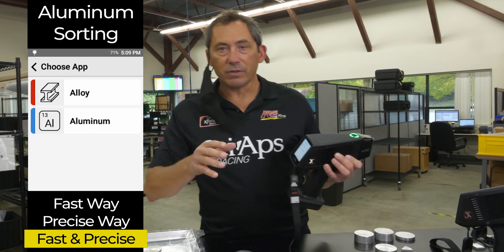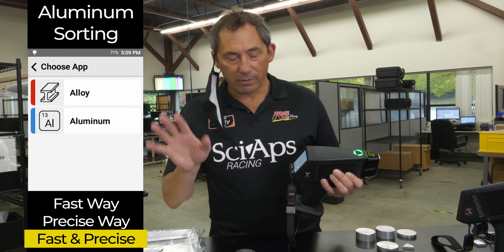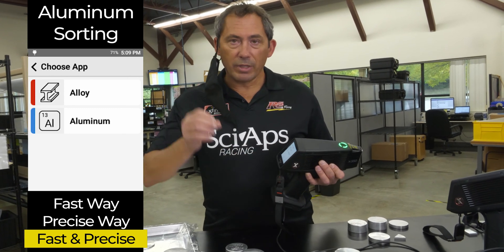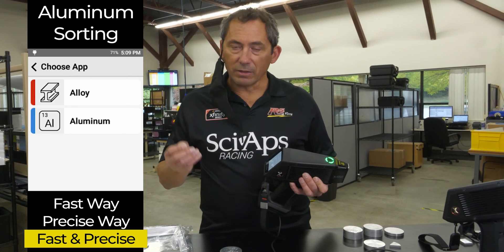There's the alloy app, which you use for everything else — all your high temps, red metals, everything. You can use it for aluminum too, but we created this aluminum app to really optimize the speed on aluminum alloys.